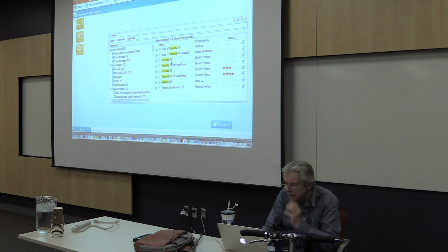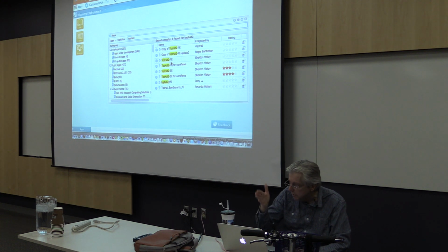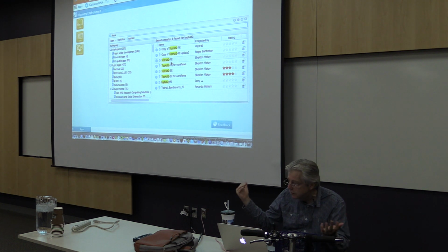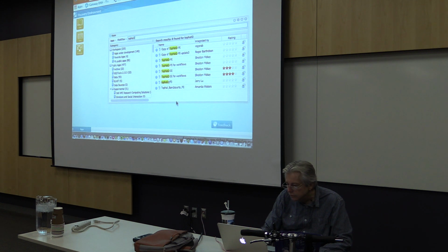But today, even though it's sort of confusing because the files are named, for example, WT1 and WT2, that could be interpreted as two related paired end files. They're not. So we would be using this one, TopHat2 single ended.